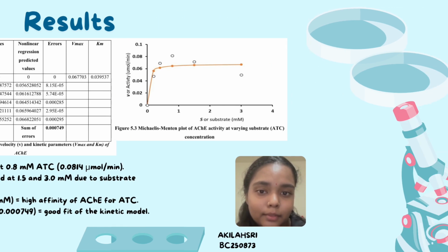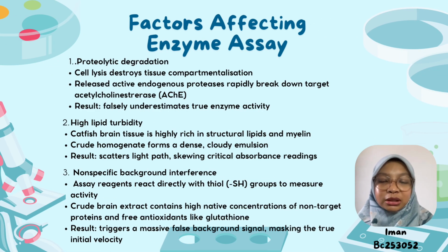substrate. Thank you. Next, I will talk about the factors affecting our enzyme assay when working with the crude brain extract from the catfish. When working with a crude brain extract before purification, we are dealing with a complex biological mixture that introduces severe interference into our kinetic data.